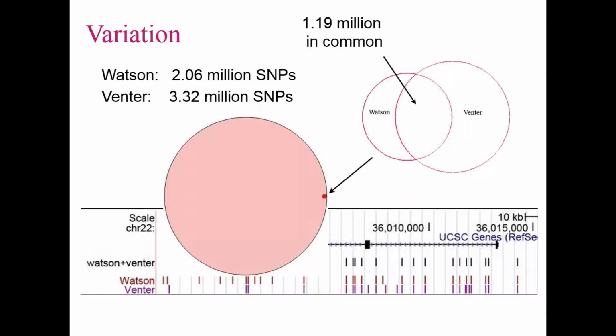So right away, you've thrown away 95% of your data by resolving it down to essentially a 1x consensus sequence. And then the next thing you do is you throw away 99.9% of that to get down to the variants, because we already know the genome, and so places where your sample matches the genome aren't particularly interesting. You like to compare your sample to the reference to find out how it differs. So you're down to that little dark red spot on here, this 1% of the genome. I'm sorry, 1/10 of 1% of the genome, but you're still stuck with 2 or 3 million variants to analyze.